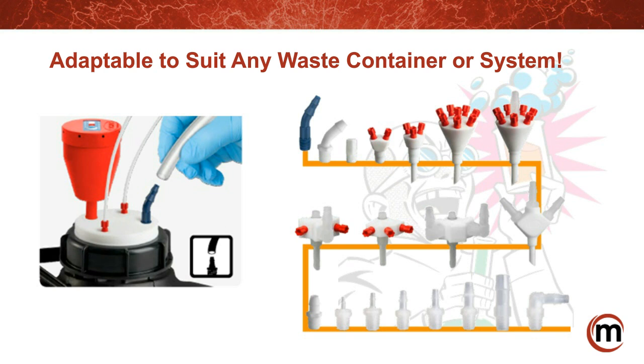Okay. And then his follow-up question is, we use empty chemical waste bottles. Do you have caps that fit standard 2.5-liter chemical bottles?